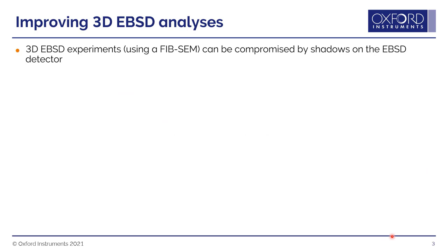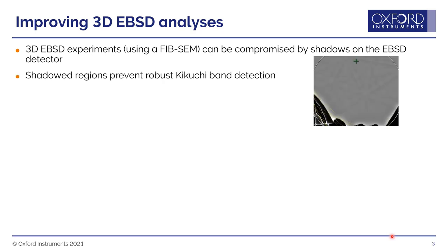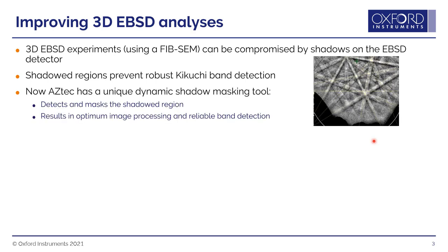We've also worked on improving data collected from 3D EBSD analyses. One problem in such experiments is shadows — the deeper we mill into the sample, the more likely it will be affected by shadows cast onto the edges of the phosphor screen. This makes a mess of standard band detection, picking out the edges of the shadowed region instead of the Kikuchi bands. So we've introduced a unique dynamic shadow masking tool that removes the effect of shadows, giving good quality diffraction patterns and reliable band detection, which in turn means high quality data.